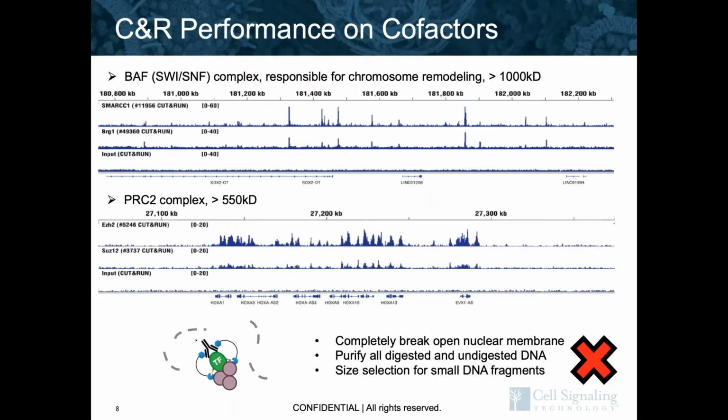As long as you pick a high performance antibody and perform the experiment carefully, you should be able to get good results for cofactors.